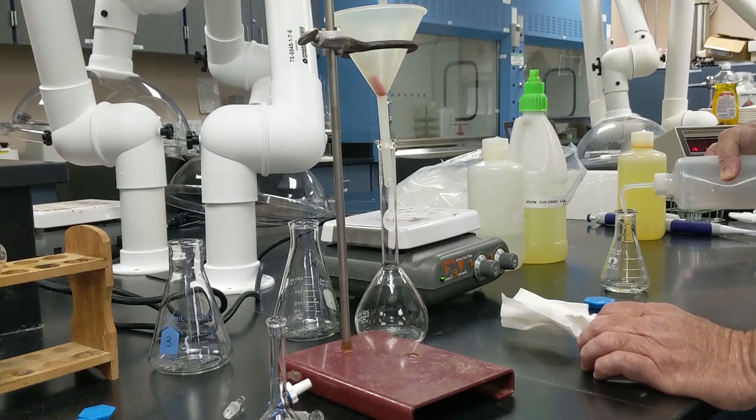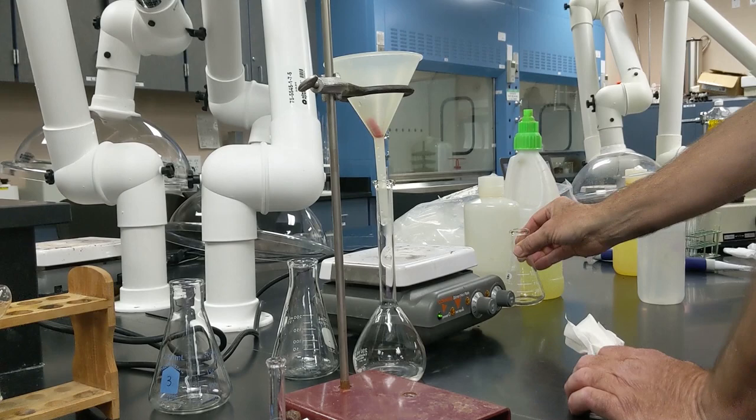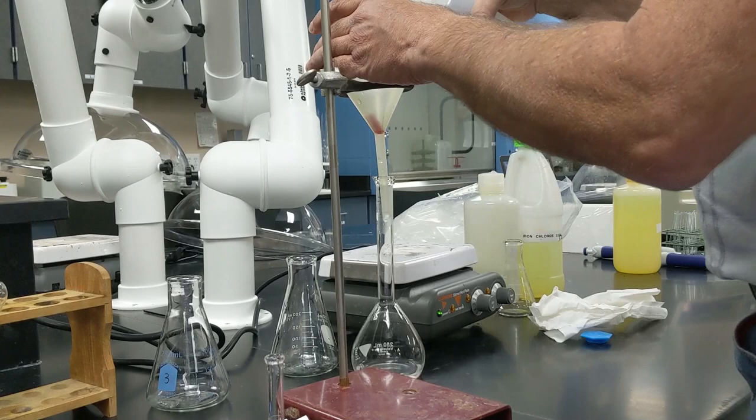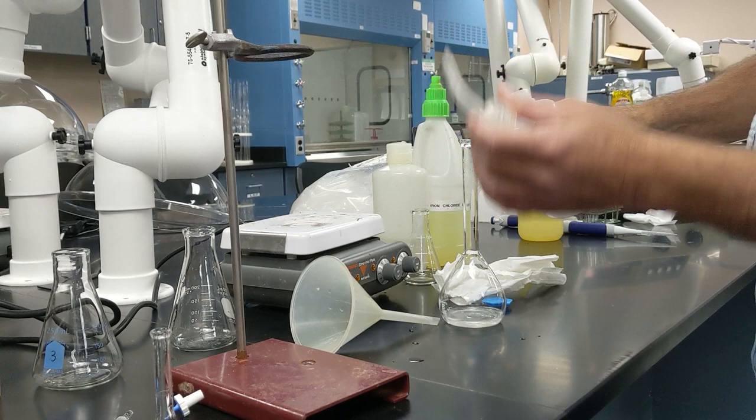So the reason I'm rinsing this is to make sure that we get quantitative transfer of all of the ground up aspirin and the reaction product of it into this 250 ml volumetric flask. Okay, so let me rinse the funnel one more time. And now I'm going to bring this up to volume. So I'll pour the purified water into here, close to the mark.